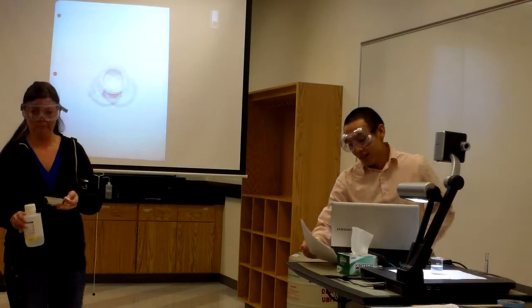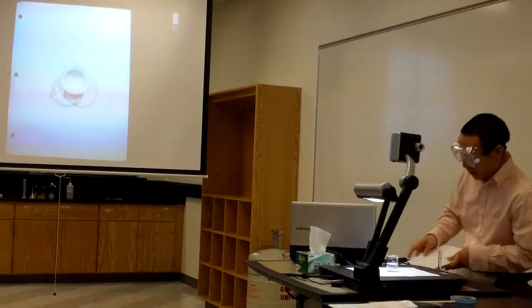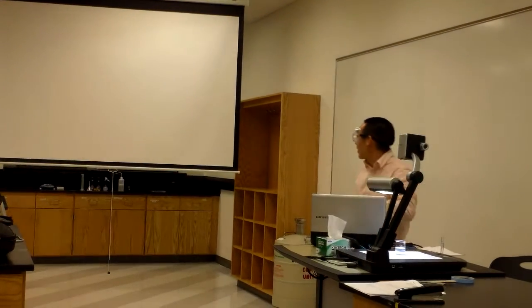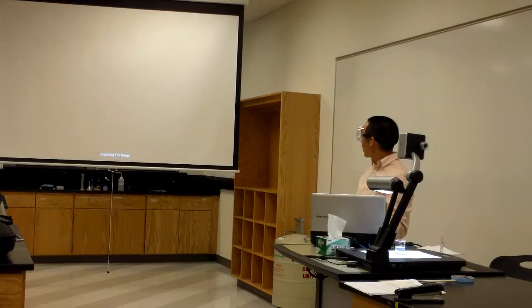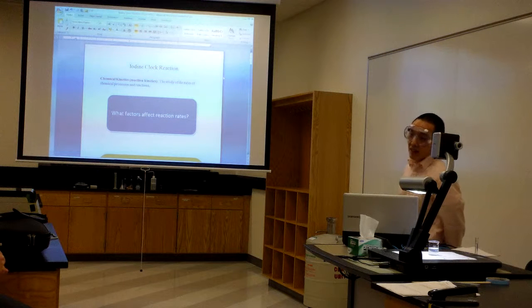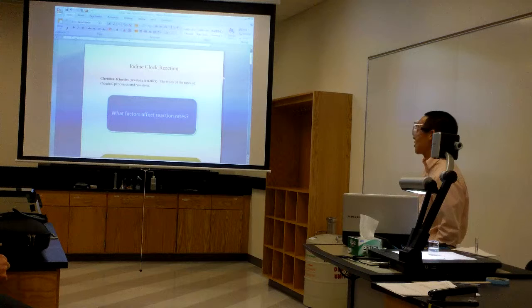Alright, so my demonstration was the iodine clock reaction. Basically, let me start from the top. Okay, iodine clock reaction. Now this reaction involves chemical kinetics. As you can see the definition I put up there, the study of rates of chemical processes and reactions, right?